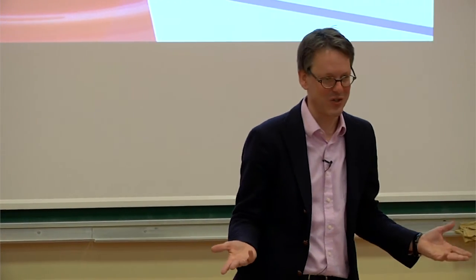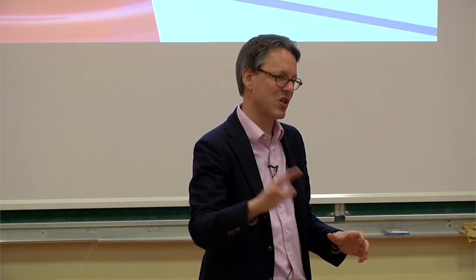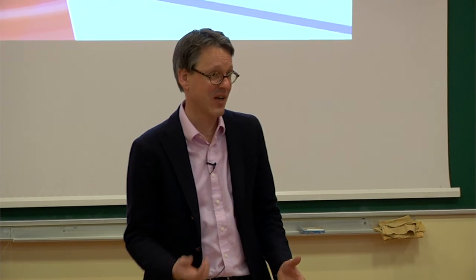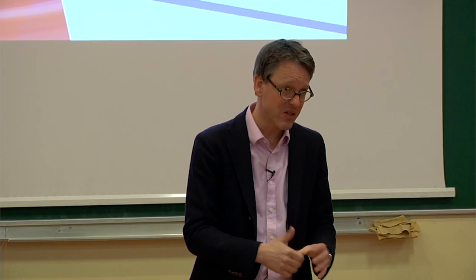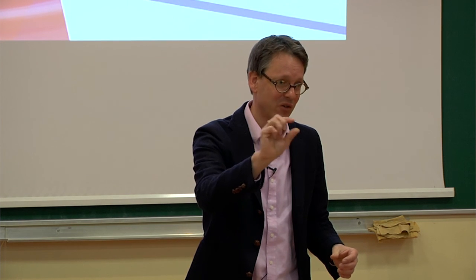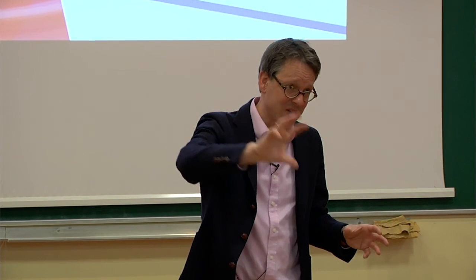So what you do is just a standard microscope, and you usually use a laser to put a lot of light on. But the trick is in the photochemistry. You switch molecules off, and so you need a photoactivatable dye, such as Alexa 647, for example. Cyanine or oxazine dyes work, and the rhodamines work in some cases. And then you put a thiol-containing compound, a reducing agent such as MEA, mercaptoethylamine, onto the sample.